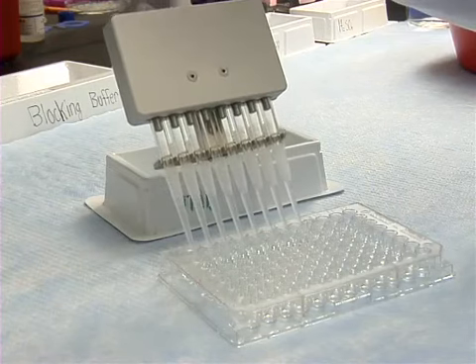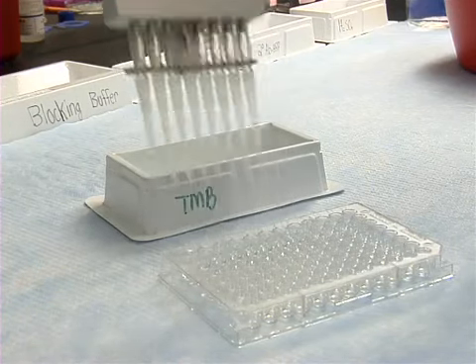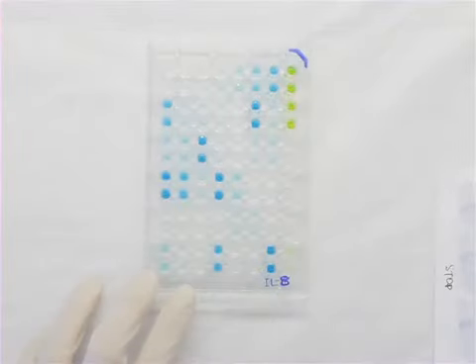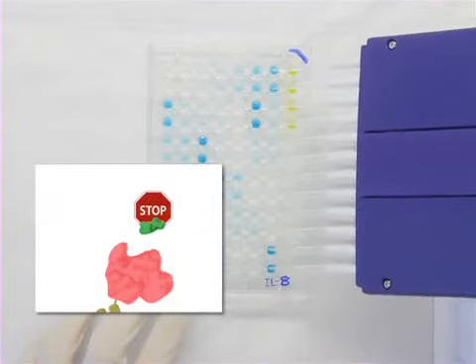Next, add the substrate to the plate to see which wells contain your target protein. Cover the plate to protect the reaction from light, and then, after a brief incubation, halt the reaction with stop solution.